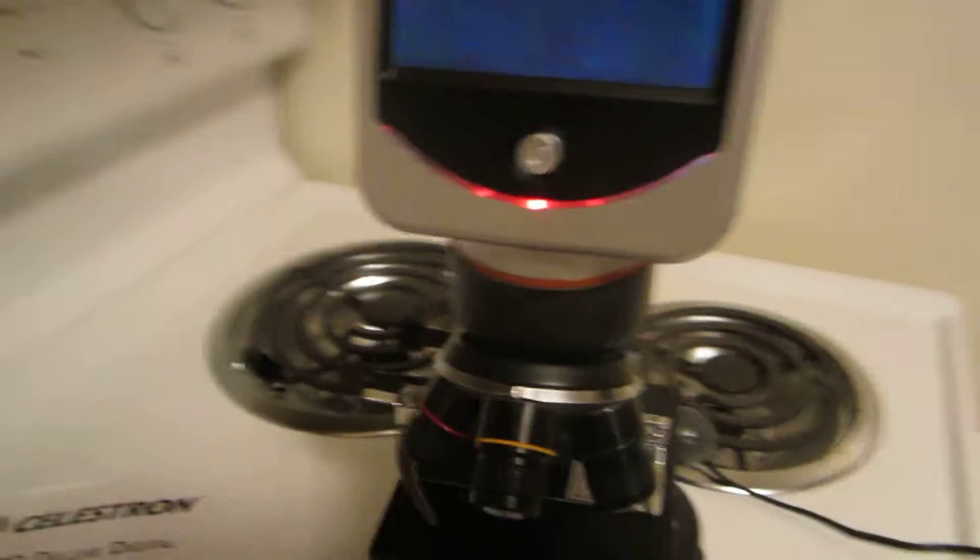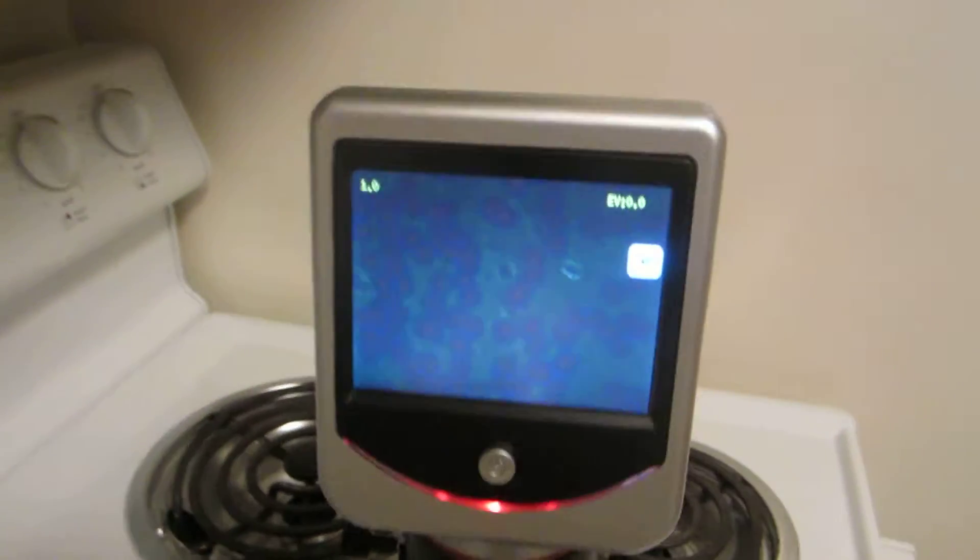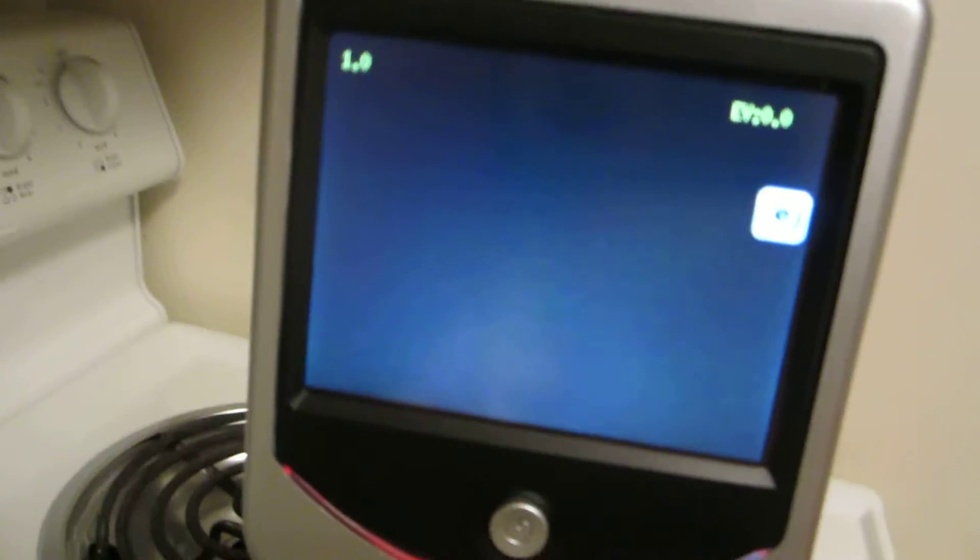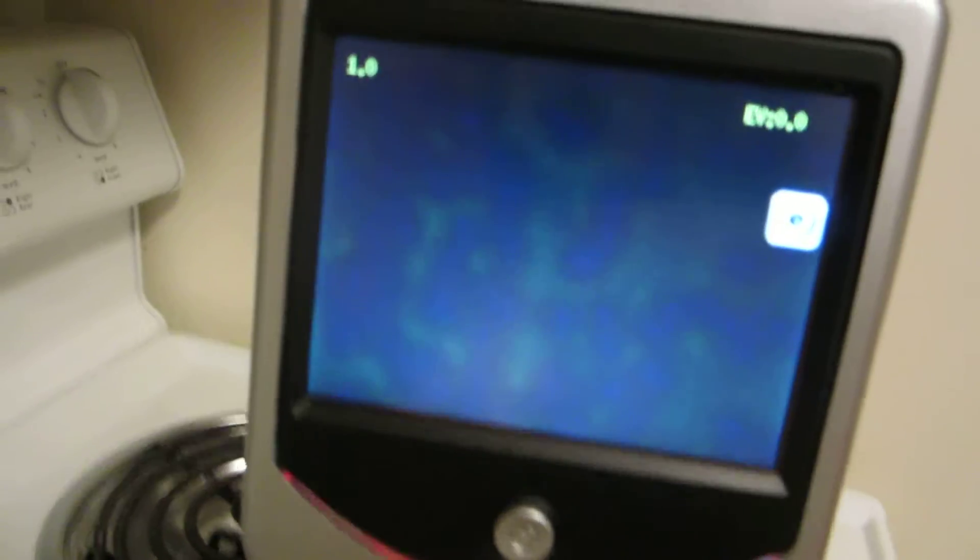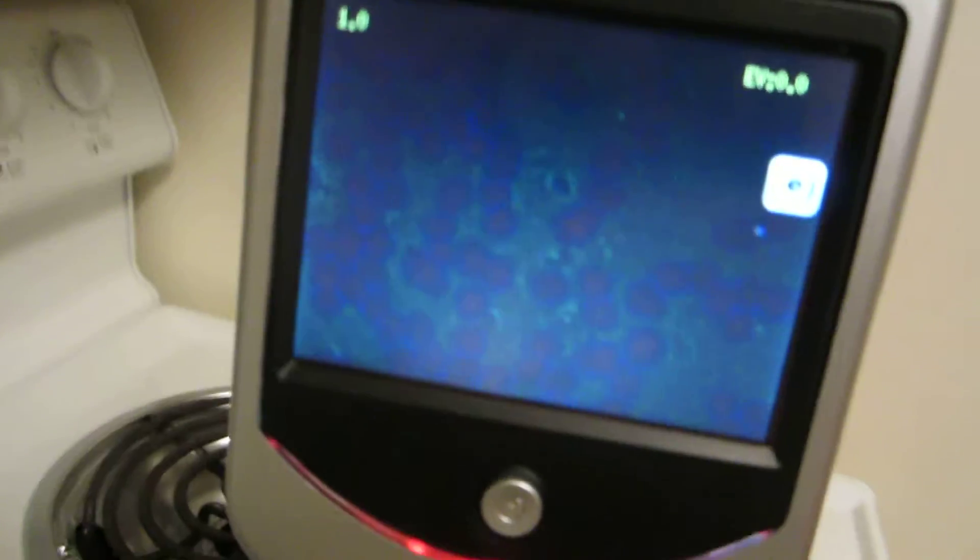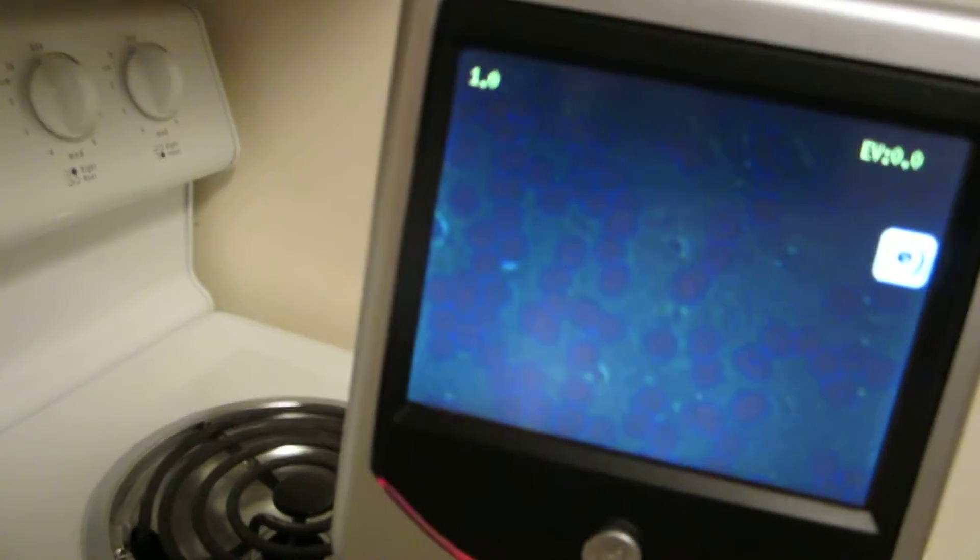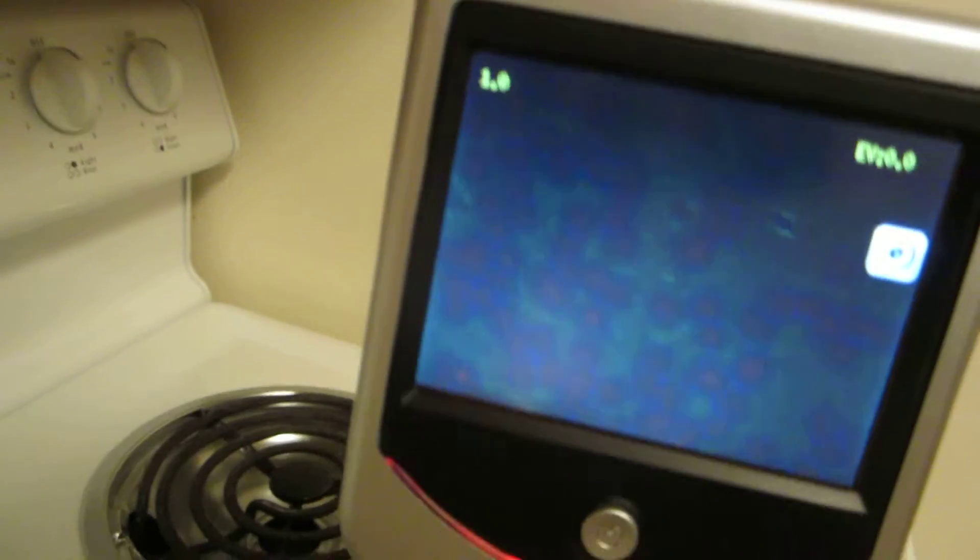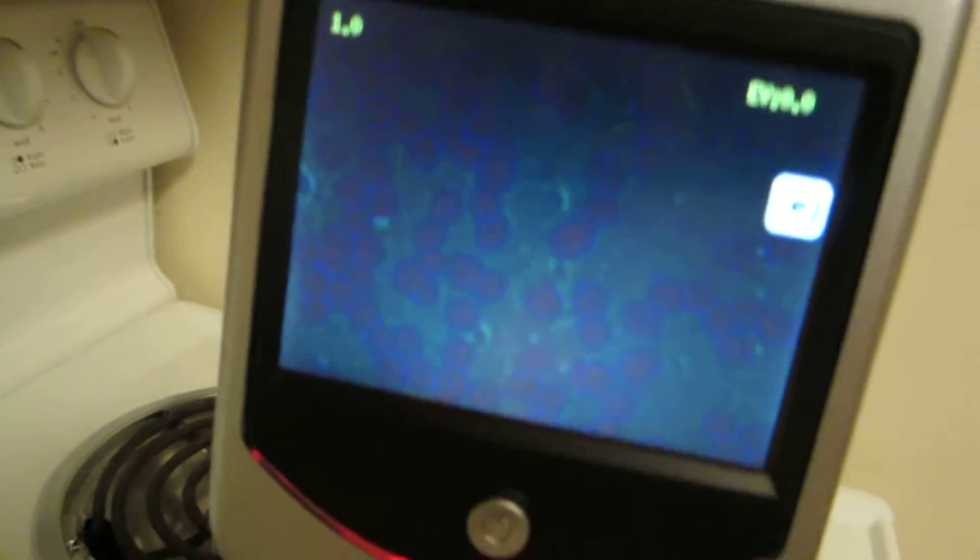Usually you should rotate this up. Now, these are almost parfocal, so they're already focused. Let's see, we'll get one more light here. Here's your light intensity at the bottom. Bring it up, there we go.